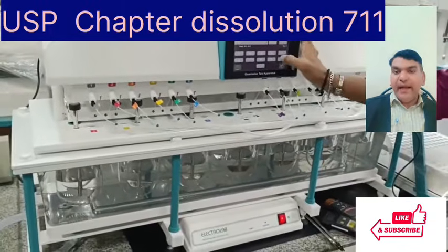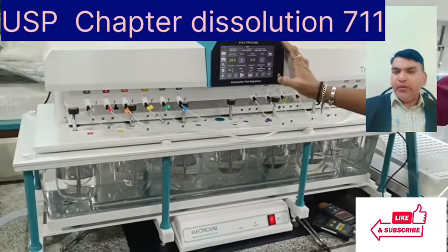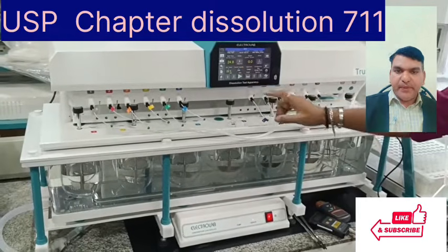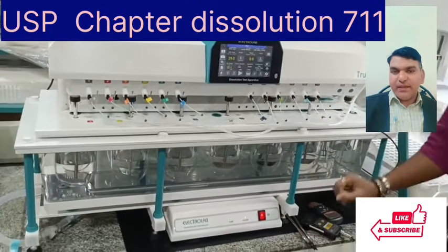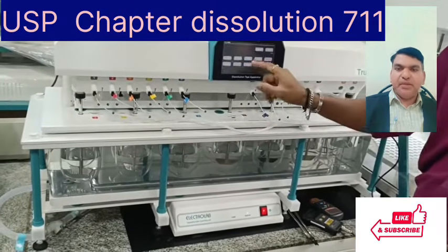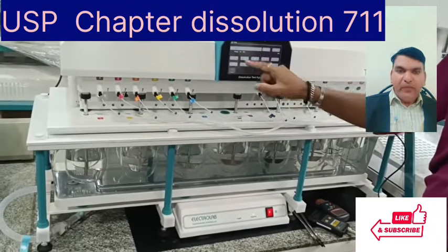As a part of this video, we will try to understand the importance of the Q and how this Q can be used in designing the specification. So let us begin with the presentation. Let us try to understand the references for Q given in different pharmacopeias.